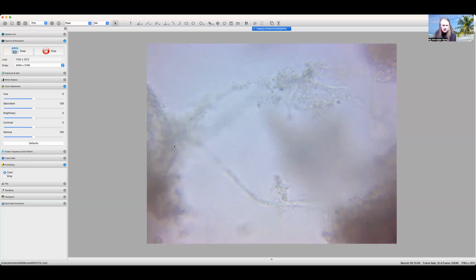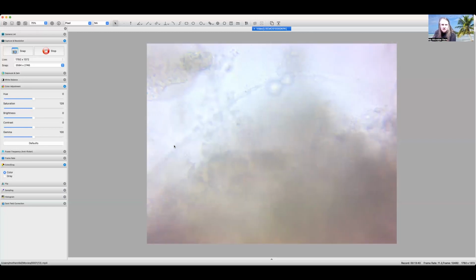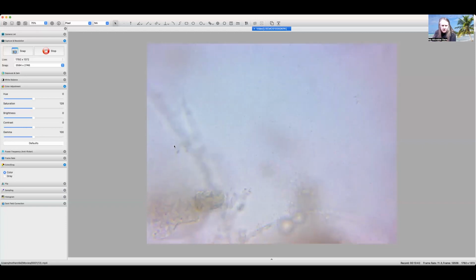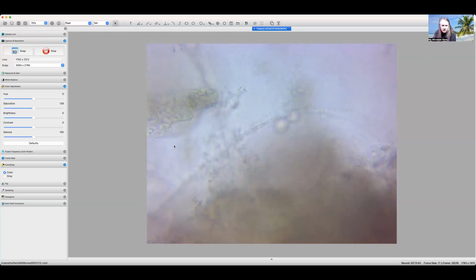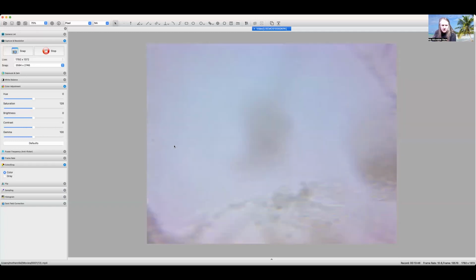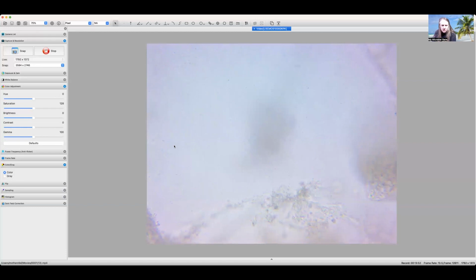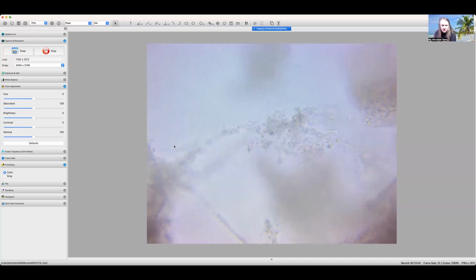But I can just tell that there's definitely fungal hyphae here, but it's not that this is just fungal hyphae. I don't know if these fungal hyphae symbiotically make these huge looking structures by gaining the help of these bacteria.